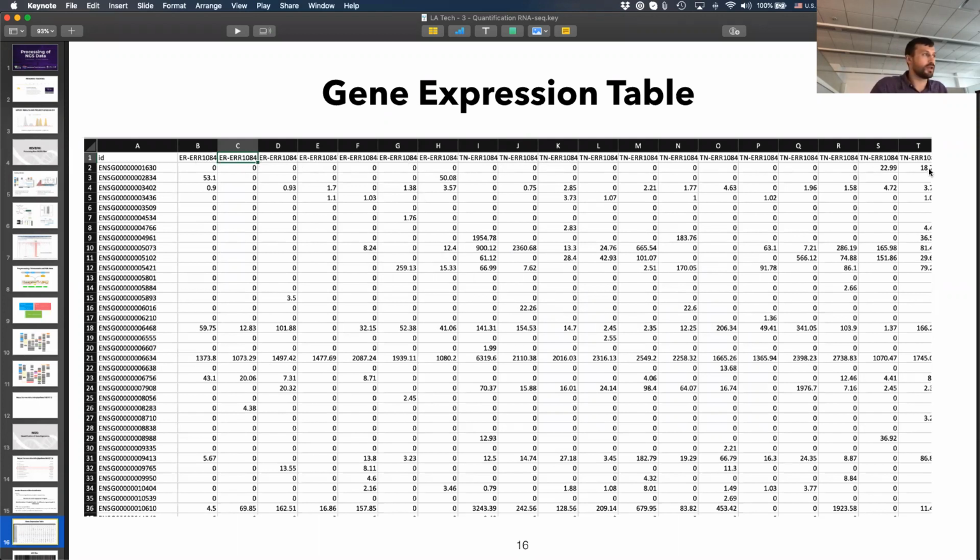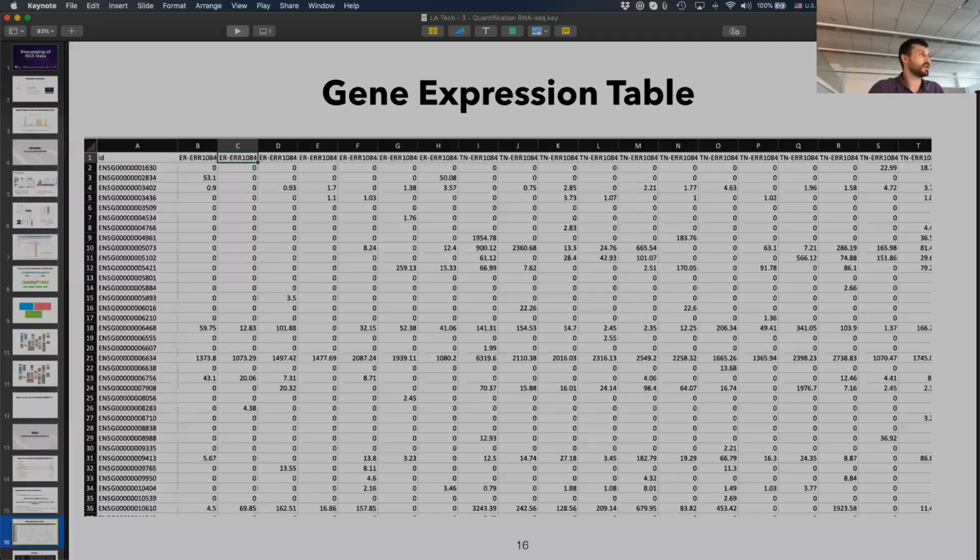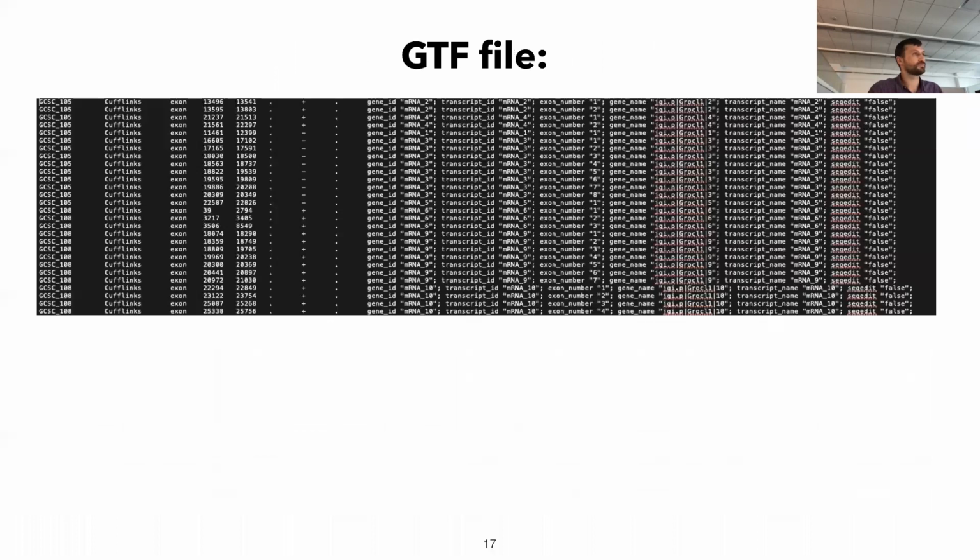We actually know that there are a couple of groups here. Now, you also see a lot of zeros, right? For example, this is a line. You can see that for this gene, there's absolutely no expression, right? So how is it that we have some genes that have no expression at all, some genes that have some expression, some genes have 259 or 1939, and some have 1.38, right? How does that work? So let's try to understand this a little bit better.